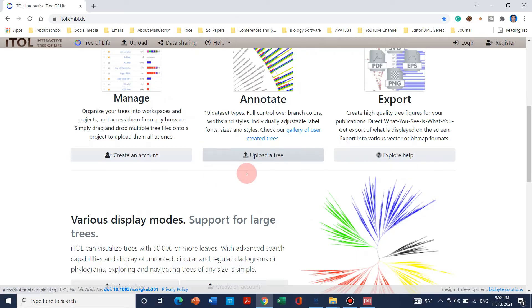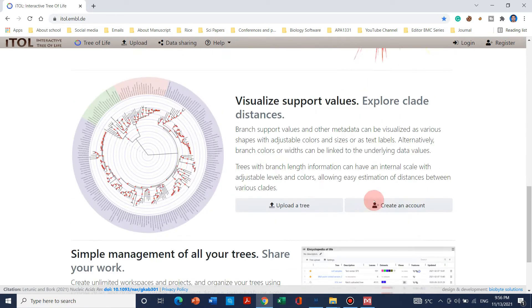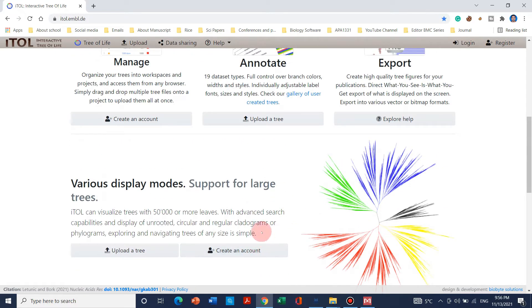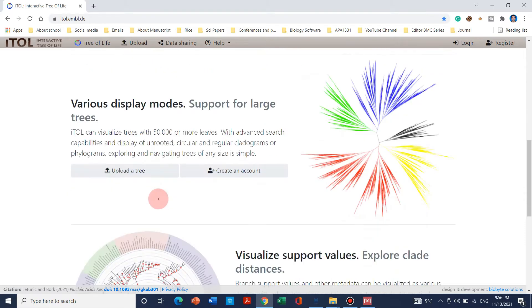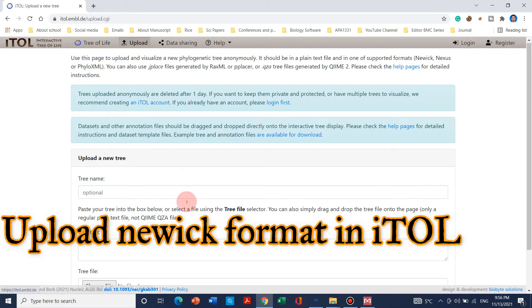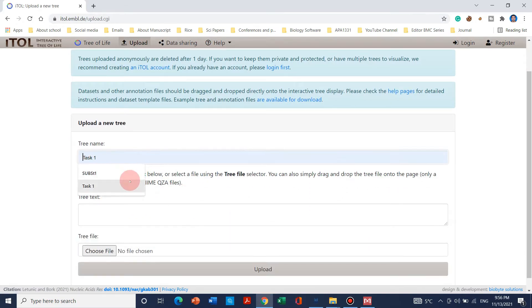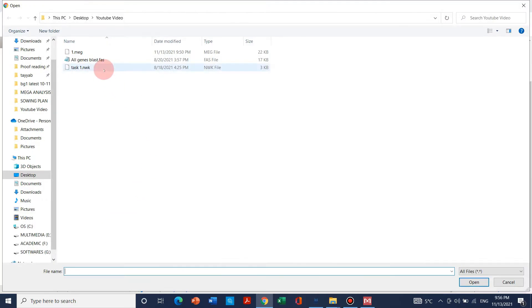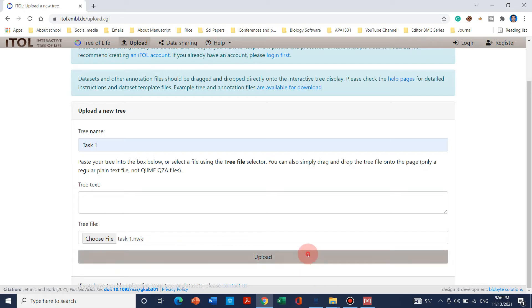Now we can go to the iTOL website to create these beautiful figures. You can use any option to upload your tree. You don't need to create an account — account creation is only needed if you want to save files, otherwise you can just simply upload a tree. Click to upload, use any name (it's optional), and choose the Newick file format we just created and upload it.